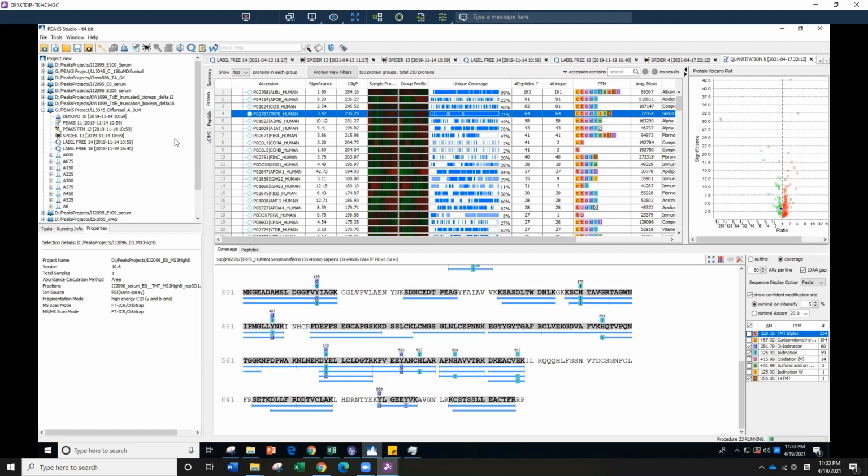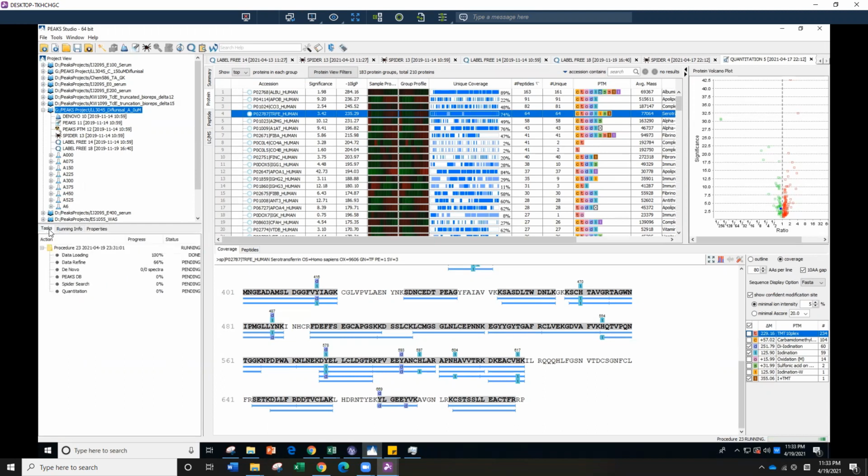As you know, we're doing proteomics, and there are thousands of data points you can look at. You really need to have the questions you have as your guide to help you navigate through all this data. Okay, so today I'm going to use one set of voting data here. Hopefully I have most of the data open so we don't have to wait, since there's enough analysis going on right now. It might slow down if I need to open any of the tabs.